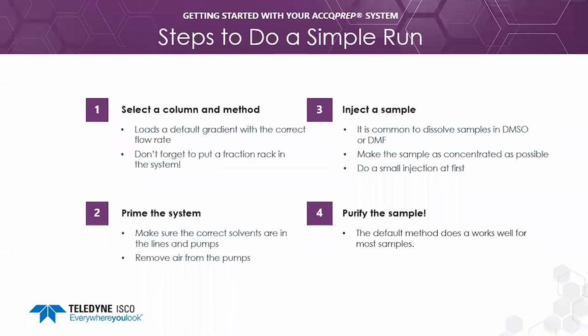One very helpful hint: before running your first sample for the day, it is a good idea to run a test sample to verify everything, including the column, is working correctly. I do this for all of my LC systems, including my analytical HPLC and SFC systems, so I can find problems before injecting my sample. I use Teledyne ISCO Universal Test Mix to test my systems, but you may use a test mix that works for you.